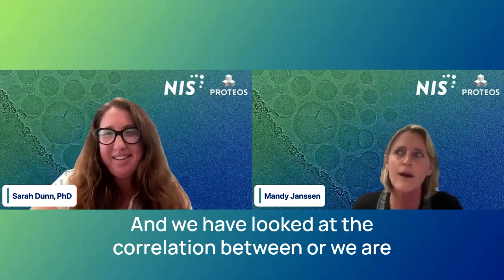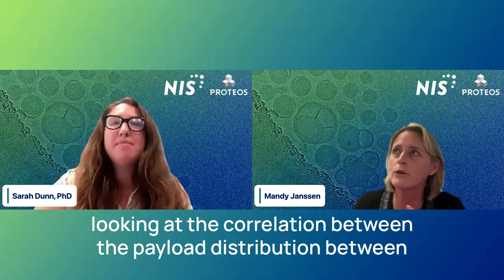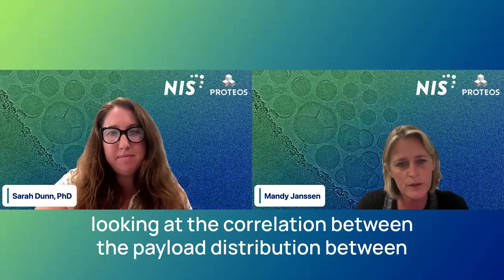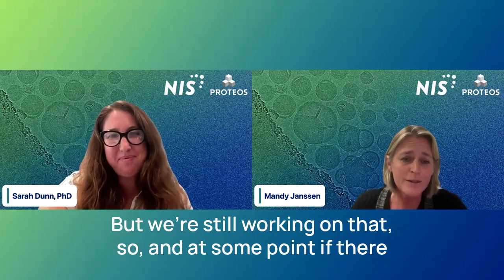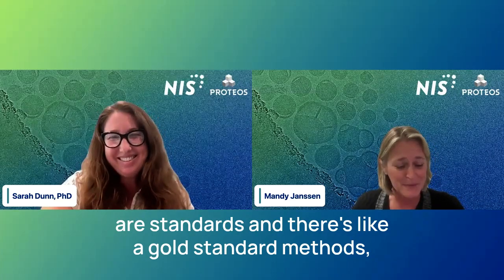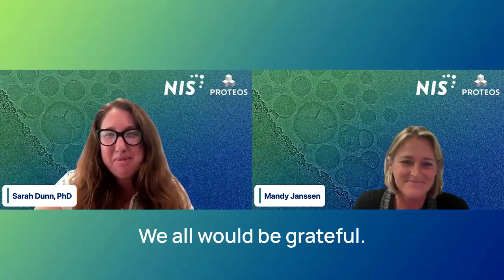Good. And we are looking at the correlation of the payload distribution between cryo-EM and other techniques, but we're still working on that. At some point, if there's a gold standard method for this, that would be awesome. Right? We all would be grateful.